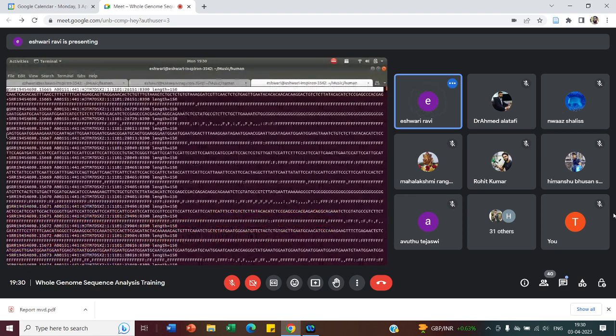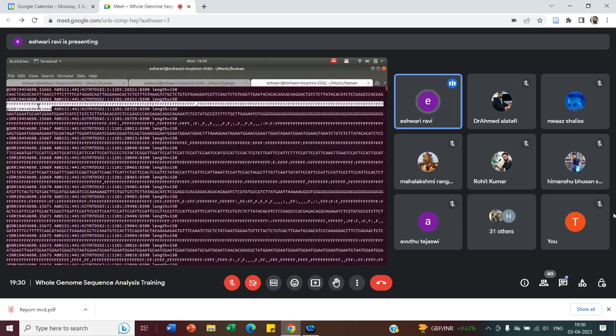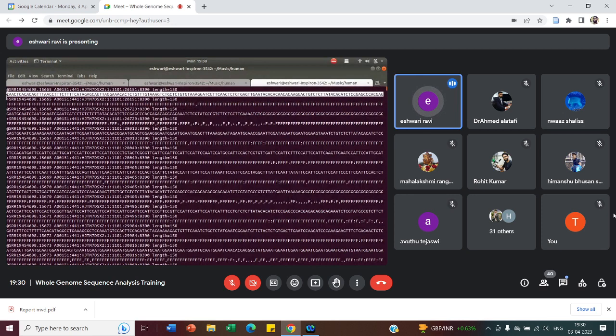And then this is the sequence file. The line I've underlined is highlighted as the sequence. Then the last line, below the plus sign, gives us the quality scores. These are ASCII quality scores. These are the quality reads for each of the corresponding nucleotides.